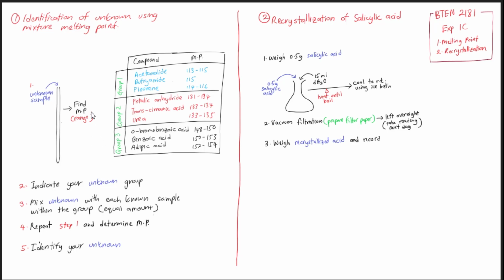Remember one thing, the melting point is not a point. Although it says melting point, it's basically a range.